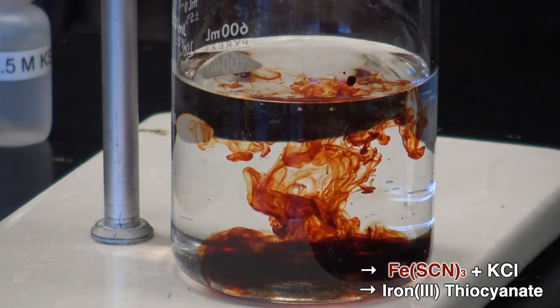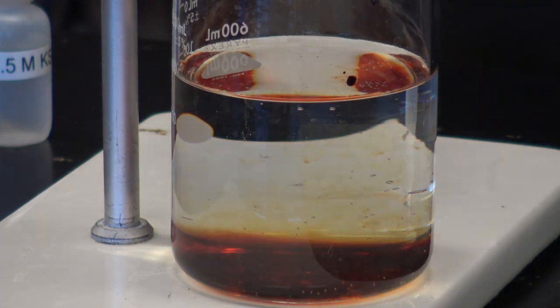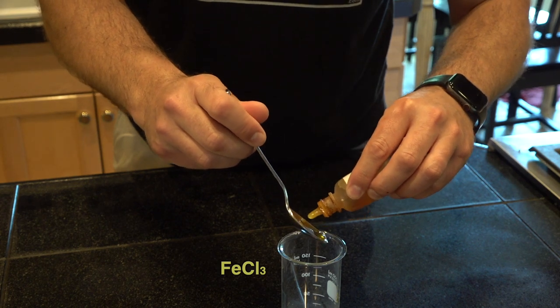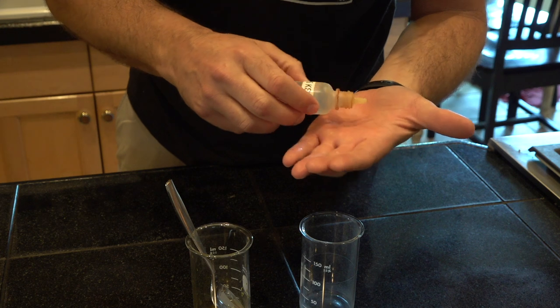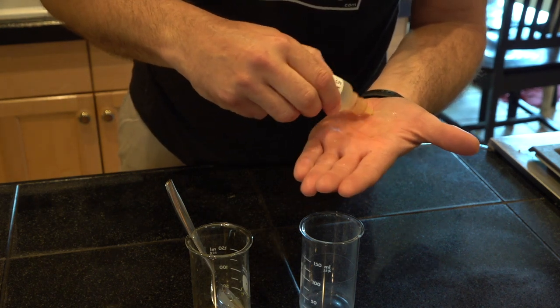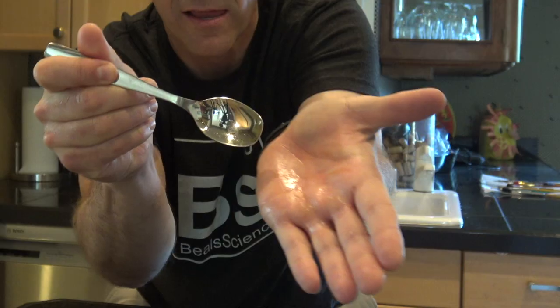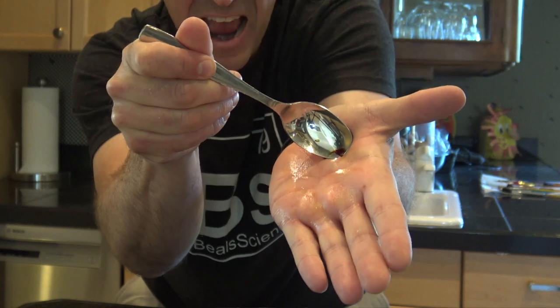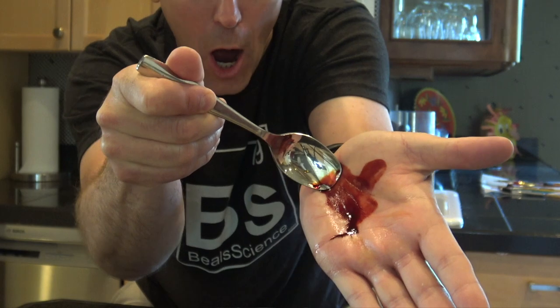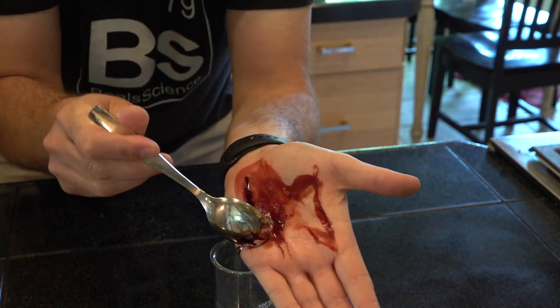I like to dump it into water so that we can really see that red color of the iron thiocyanate. And as a chemistry teacher, I'm always trying to use things like this to get my students' attention and to teach new things. One fun way to do that is to take these same two chemicals and put them on utensils. I'm going to put the potassium thiocyanate on my hand — and look what happens. We get this nice simulation blood on the skin.